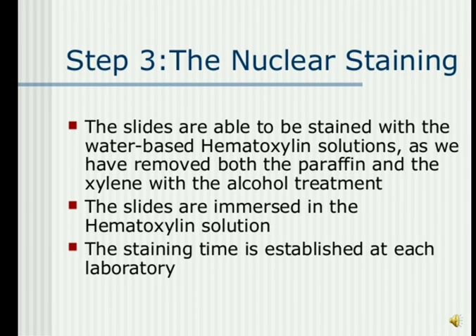Next step is nuclear staining by hematoxylin. The slides are immersed in hematoxylin solution. The staining time established at each laboratory is different according to the hematoxylin prepared. If a fresh batch is prepared, then the slides are kept for a little time, and if it is more than a week old, then they are kept for a bit longer time.